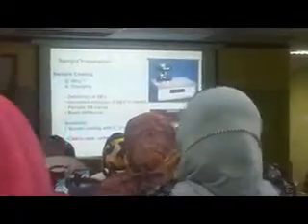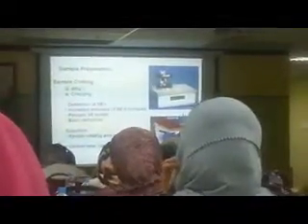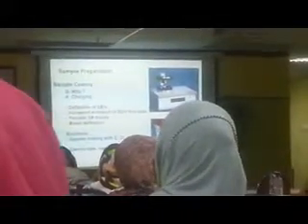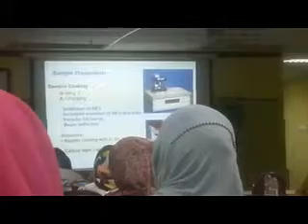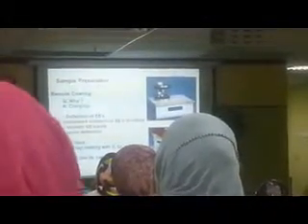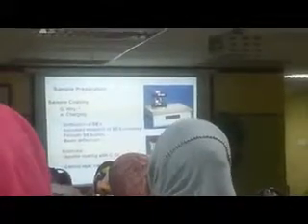Because many of you are also doing ceramic samples, some of you are doing polymer samples which are not conductors. So they may have to be coated using gold or platinum or something, a very thin layer, not a really thick layer. When they say gold, don't think they will put a thick layer. After coming back, you can take it. You don't even see it.